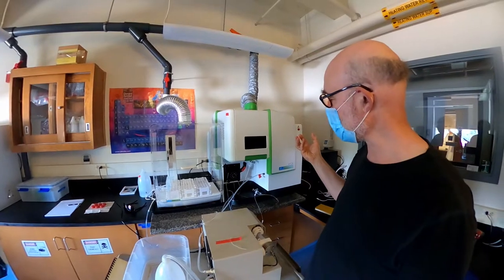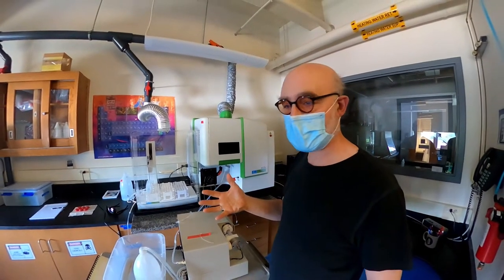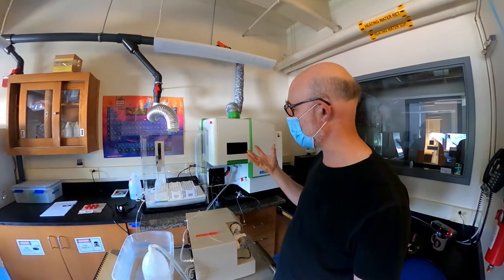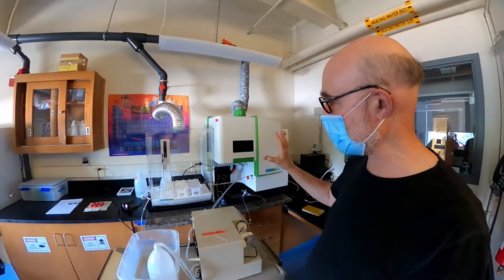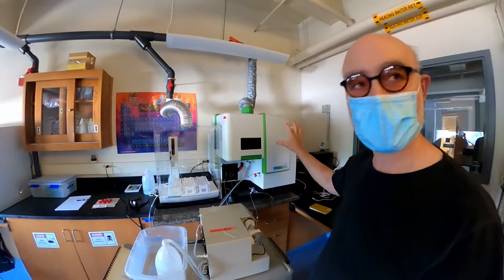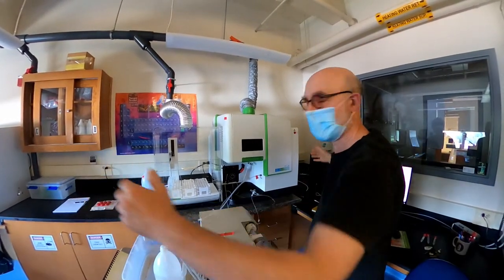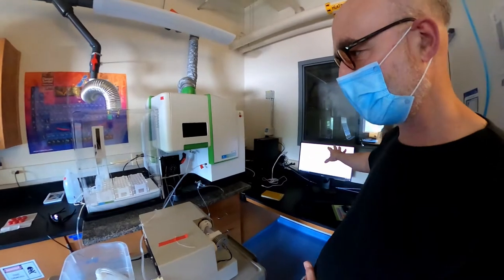When those electrons cascade back down, they emit light of a particular wavelength. And that's what we analyzed with this machine. The machine itself, you're looking at, this is about $60,000 right here. You can wrap your arms around it. Controlled by a computer here.